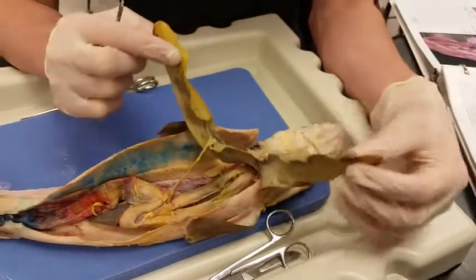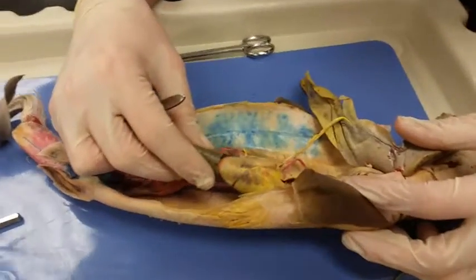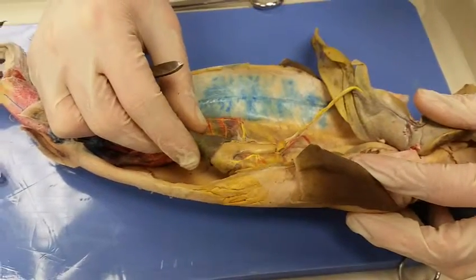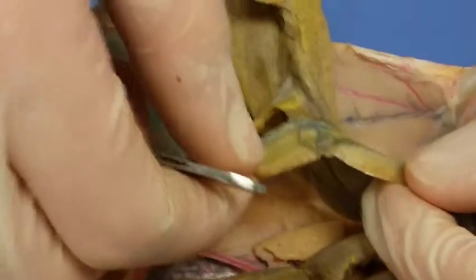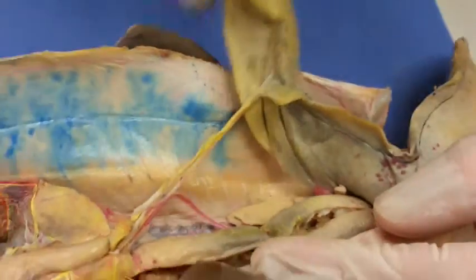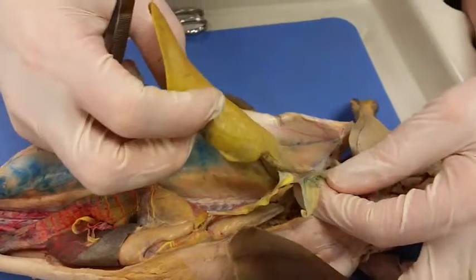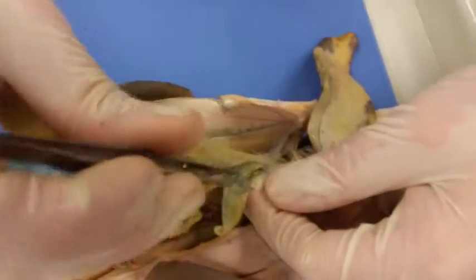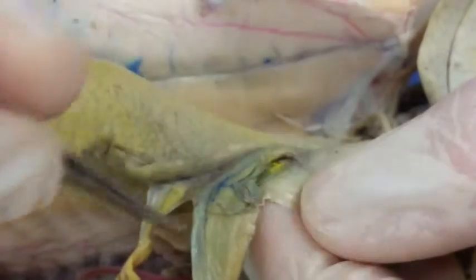Okay, so we have the right lobe of the liver and the left lobe of the liver. Right, left. Spleen, once again. And the median lobe of the liver is much smaller, but this is the median lobe, right in the middle. Makes sense. And then, see if we can't find the gallbladder again. The gallbladder looks like it was kind of punctured in ours, but the gallbladder should be right around here. Kind of a long longitudinal extension rather than a circular organ.